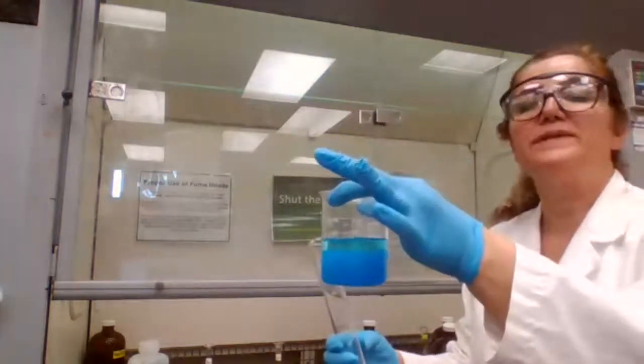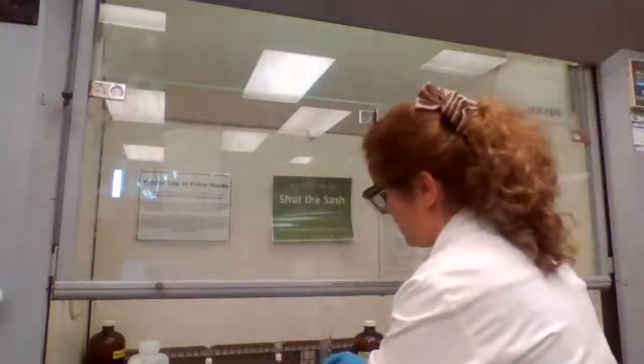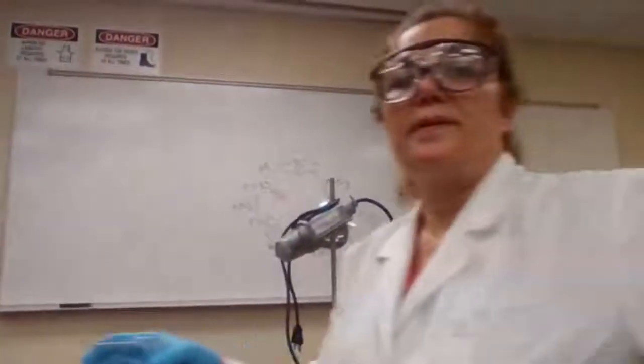Record your observation, please. And tell me what is the next step. Next step, heat.